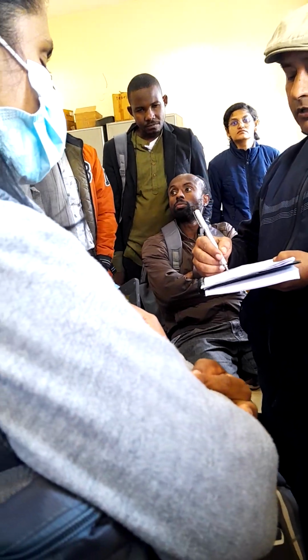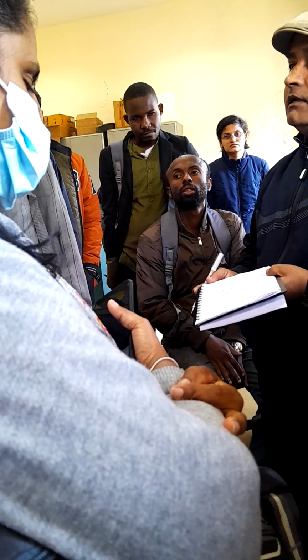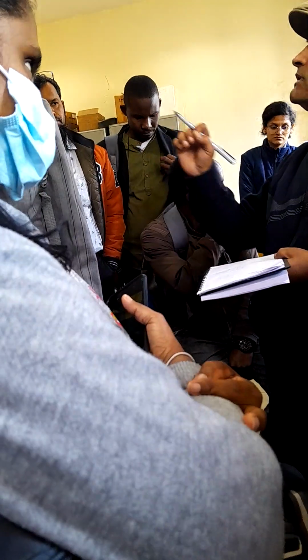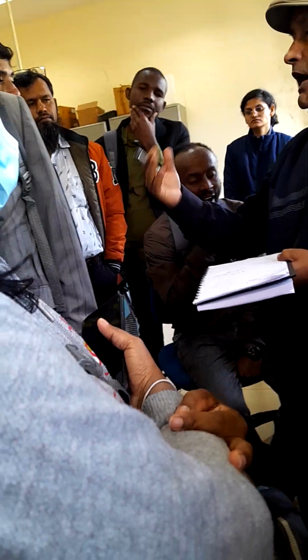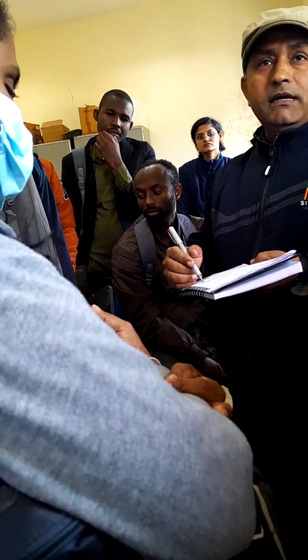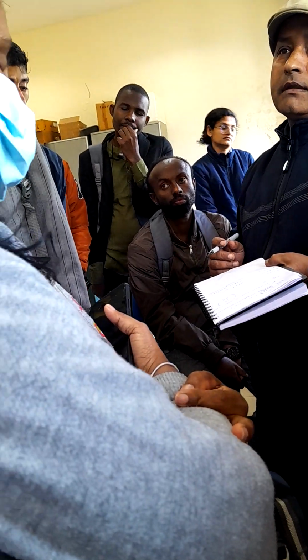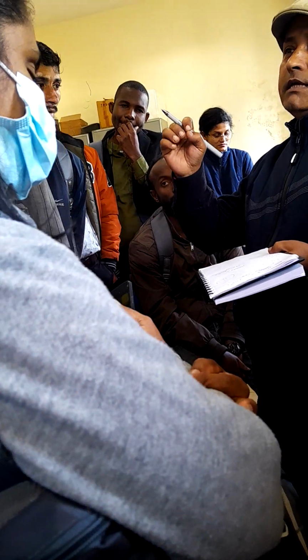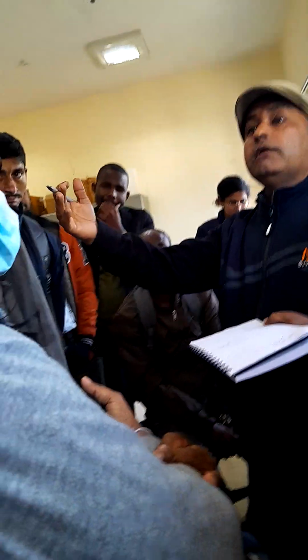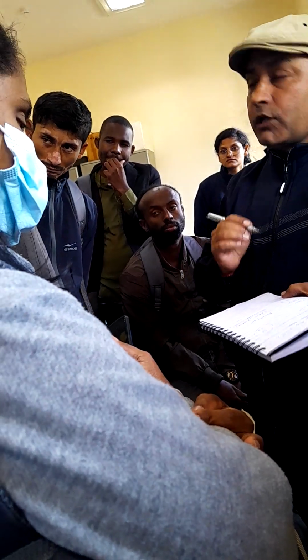So I can go for the cetane index. Cetane index is just like the cetane number, but it is 6 to 10 lower than the cetane number, because the cetane number is actual, done by the engine, and this is by calculation. To calculate the cetane index, we require density and T10, T50 and T90 data. Sometimes in an automatic ASTM D86 unit, as against the manual one, the unit will calculate the cetane index itself. So that is also required.